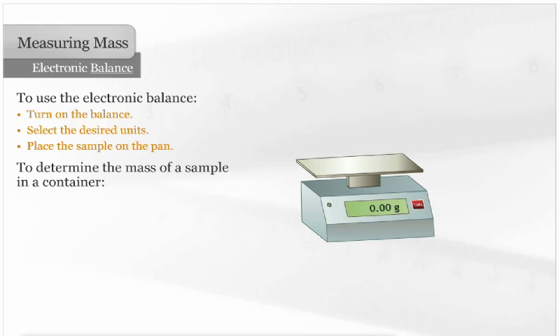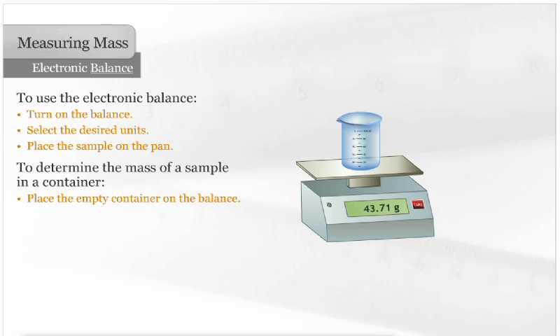To determine the mass of a sample in a container, place the empty container on the balance and press the tare button.